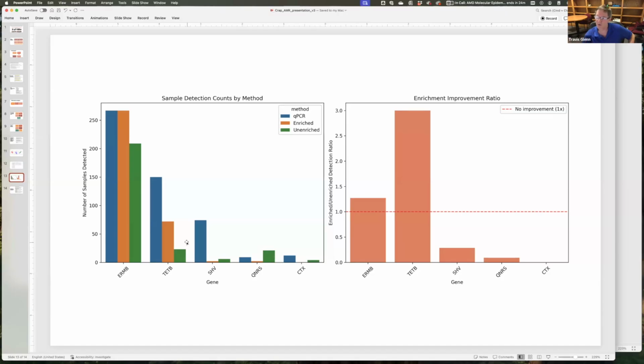One way in which you can increase your detection probability is just to sequence more. So all of these results, even though we've normalized per million reads, if we sequence a bunch more, some of those samples that are pretty borderline on how many reads we have will jump up to where we expect to see these detections increasing.